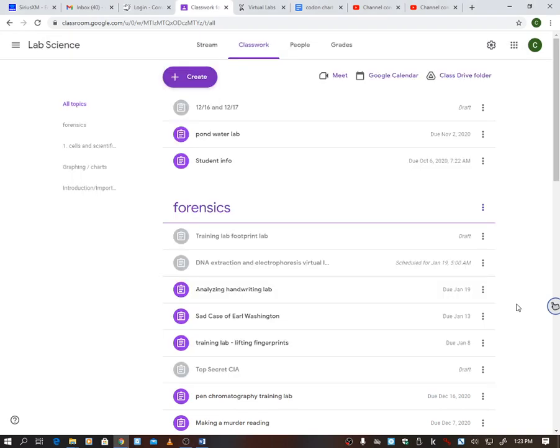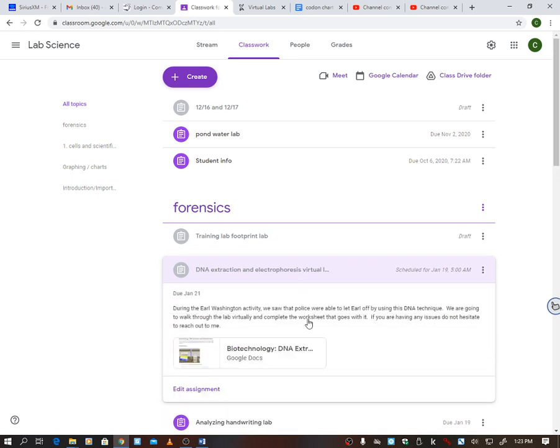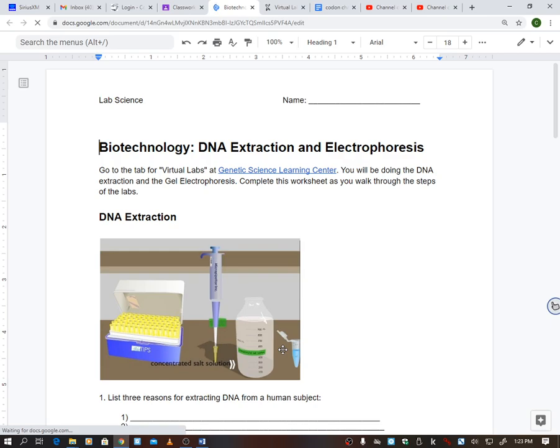Lab Science, we are going to be doing a DNA extraction and electrophoresis, the virtual lab. They talk about this in the Earl Washington case, but we don't have the materials to do that. A lot of high schools aren't going to have the materials to do that. So there is an online version that I'm going to have you guys do just so you can get an idea of how this happens.